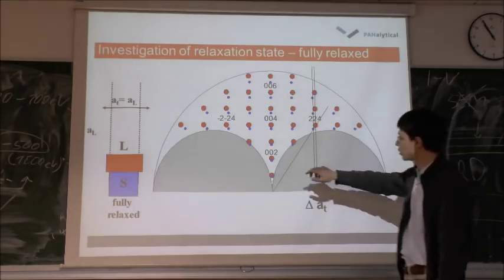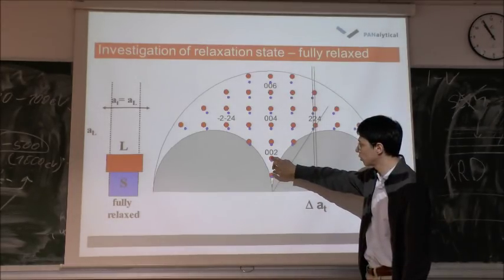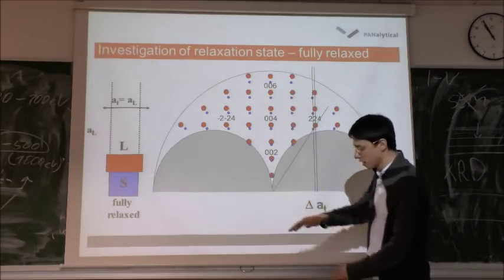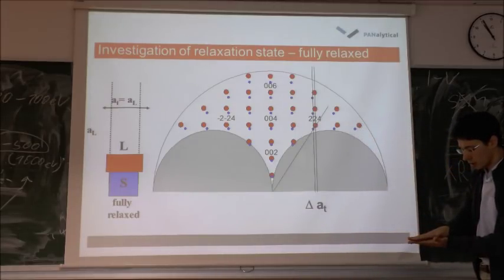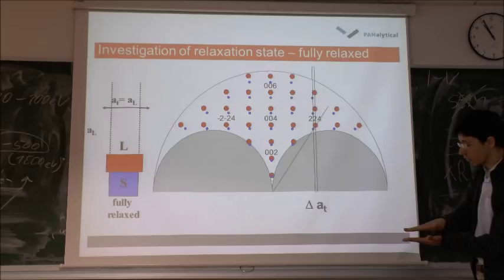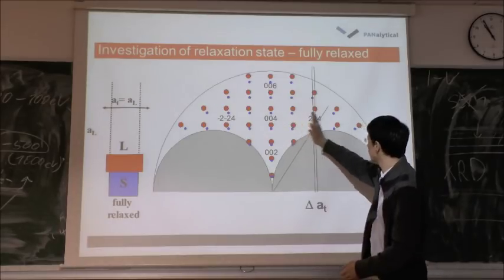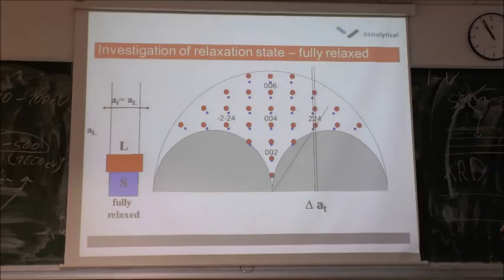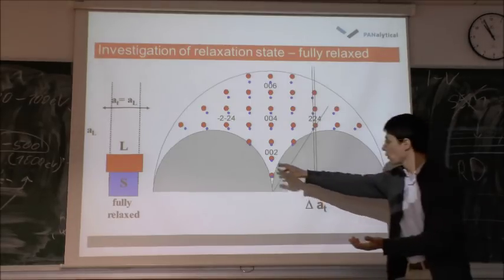So let's say this is a full reciprocal space map. You have points which are related to the substrate, and you have points which are related to the thin film. These are the so-called symmetrical scans, which are done in direction parallel to the surface. In addition to that, you can have asymmetrical scans, which are these scans, left and right of the symmetrical scans. With these scans, you analyze planes which are inclined with respect to the substrate. Basically, with symmetrical scans, you can figure out what is the d-spacing, so this is the spacing in out-of-plane direction. Here we have 00L spacing.